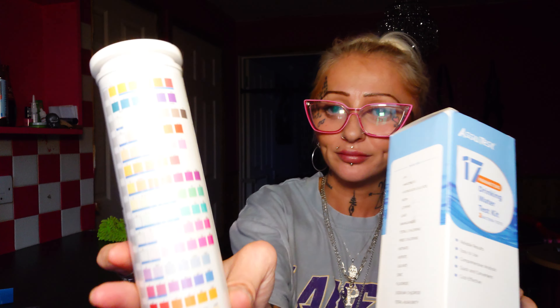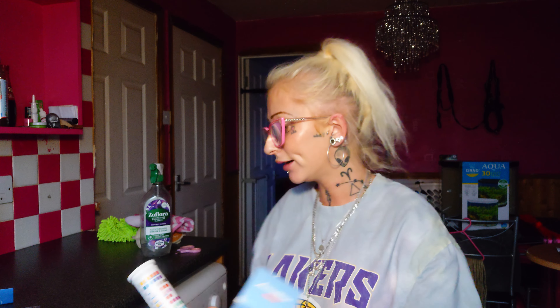Still getting rid of that gunk from the COVID, but yeah, this is the water testing kit. It came with two bacteria testing kits. I've always been really interested in what the hell my water is up to, because the hot water smells like rotten eggs at times.